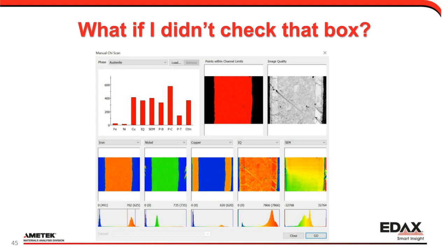I can see it's speckly. I'm missing some areas that I don't want to miss. So I'll have to go back, change those threshold bars, and essentially increase the area that I'm including in the austenite phase. Again, it's just a way of doing it. And I click on the Go button, and I go at it.